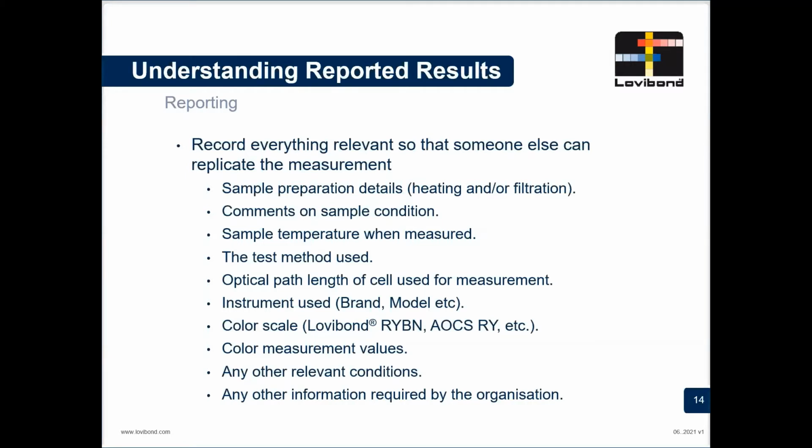communicate information about the sample. We also want to actually record what the temperature of the sample was when we measured it, which test method we're using, so which standard are we following? Are we following an ISO method? Are we following an Indian standard method or an MPOB method?